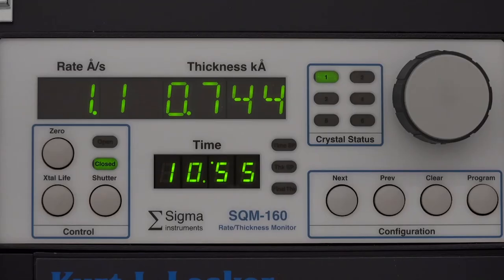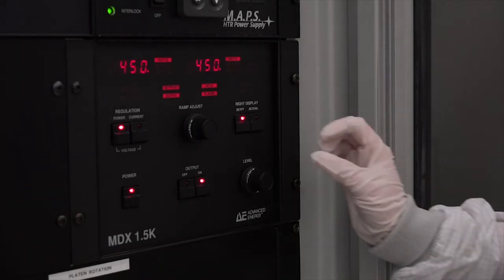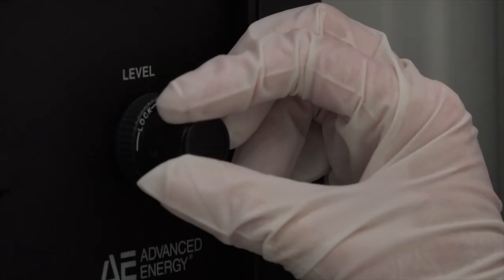So, we are nearing our target thickness of 75 nanometers. Okay, now I will close the shutter to stop deposition. And now we can slowly ramp the power back down. After ramping down the power, we can turn off the power supply and the plasma goes away.